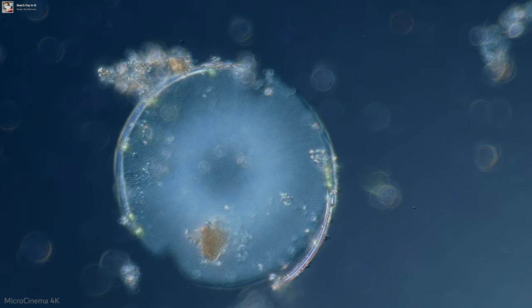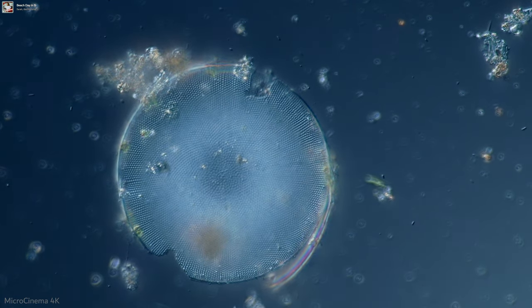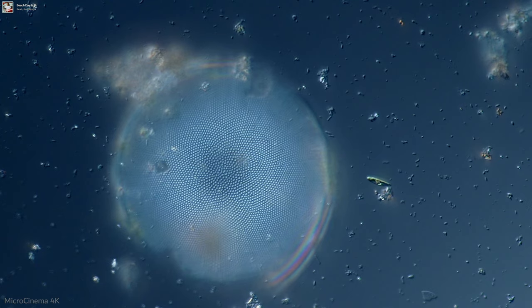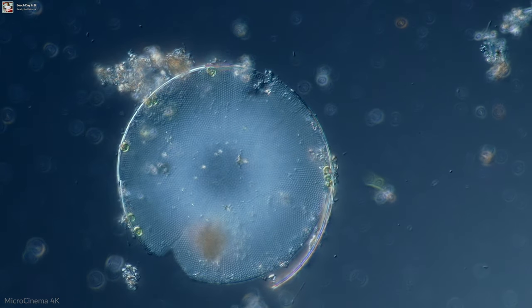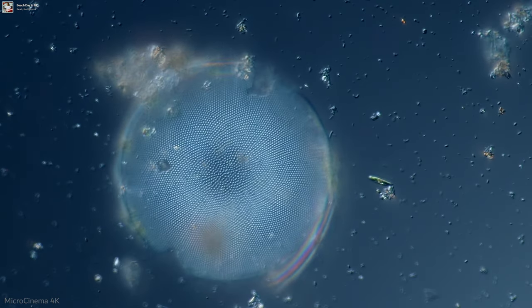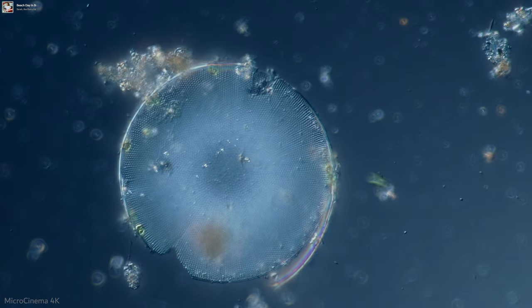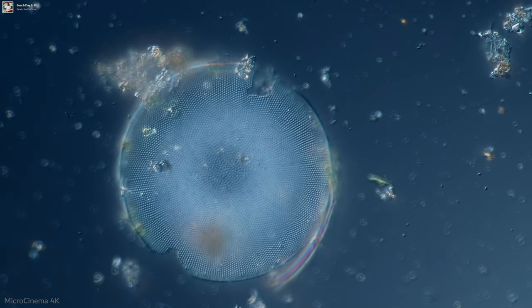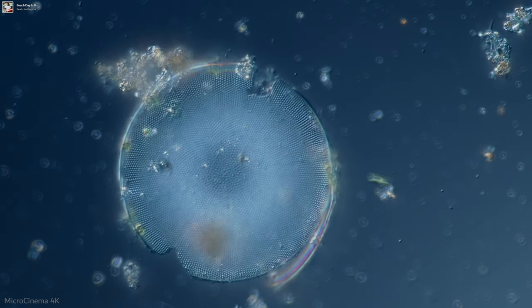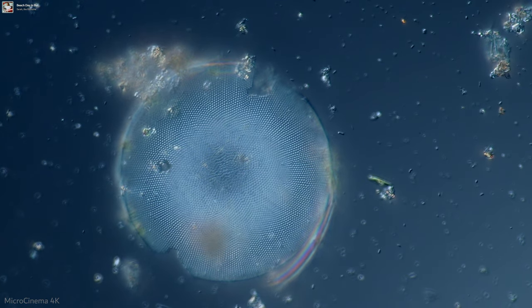so it's one of the valves, and the valve is actually sort of upside down. So this is the top, and now I'm going to focus down through it, and you can see that the edges come into focus first, and then the center. So the center is actually down at the bottom right now, and that's coming up at the back. And so these diatoms usually have two valves that are clamshell packaged together. And it's a really interesting effect when you focus in and out of it. You get these patterns, sort of a moiré pattern that we're seeing. That's neat.